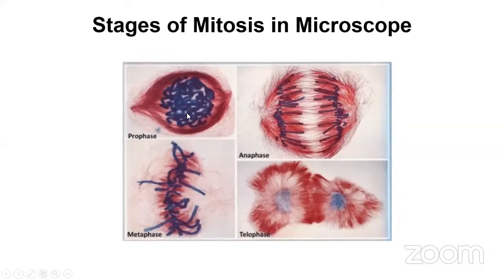If you see blue color, that is specifically what it does: it stains the chromosome. Now, what you saw in the video is that a root tip was taken and placed on a slide. The slide is the rectangular glass structure. You were putting a small, tiny root tip on it.